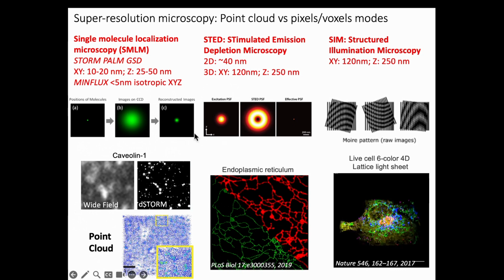Another approach is called stimulated emission depletion microscopy, or STED. STED essentially functions by aligning a laser in the shape of a donut that will deplete fluorescent emission, actually shifted to another wavelength so we don't see it, on the outside of the point spread function. So essentially all we're seeing, the effective PSF, is what's coming through the hole in the donut.